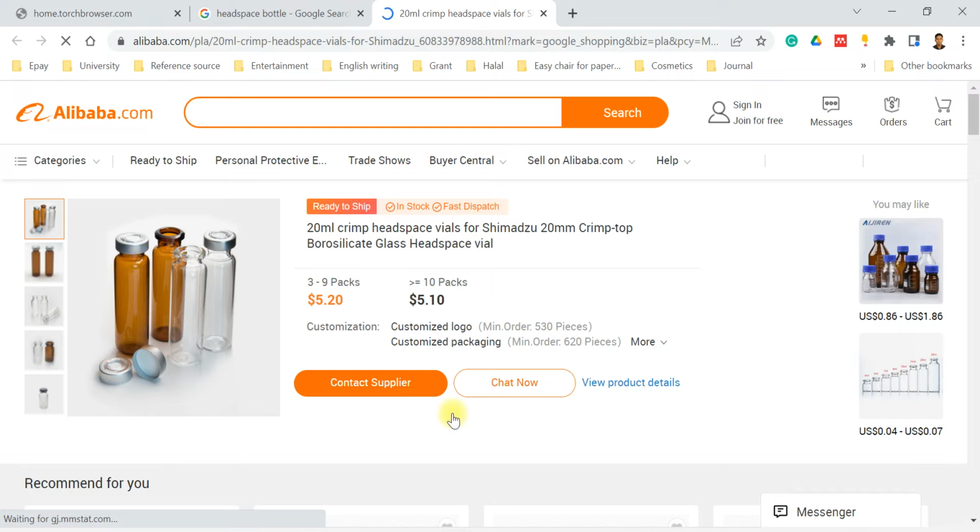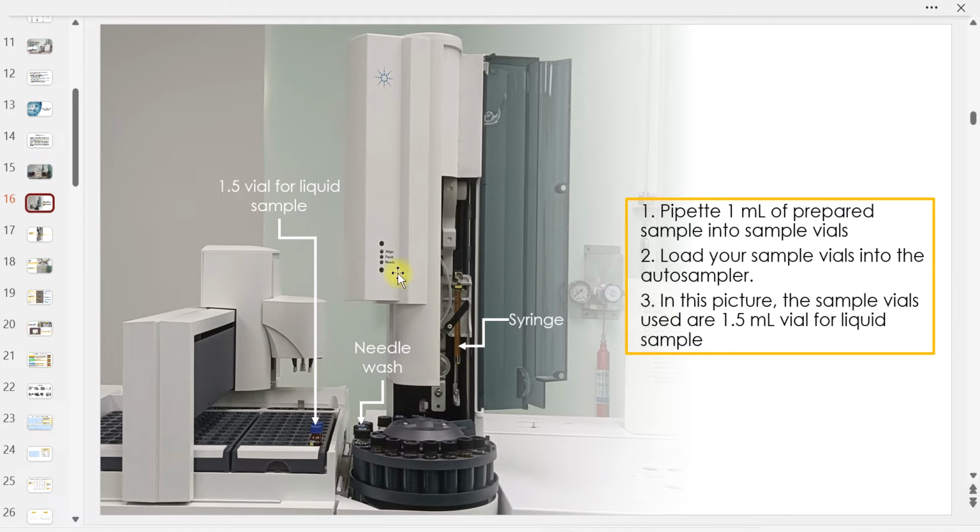So if you have a liquid, kita akan pakai this one. Yang samalah. Lagi tepat sebenarnya kalau we go for liquid. But if you looking for volatile, flavor, sensory, contoh kita buat sensory evaluation, dalam tu kan ada odor punya ni, and then you want to know which odor that may reflect why people choose this ranking for odor during sensory.